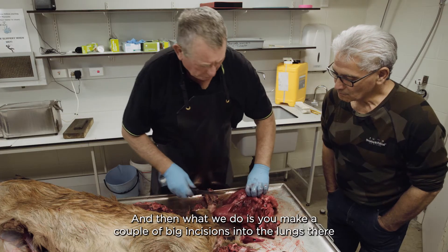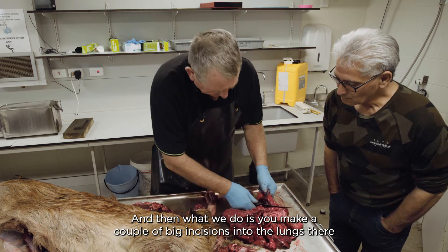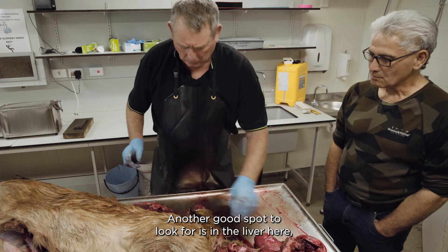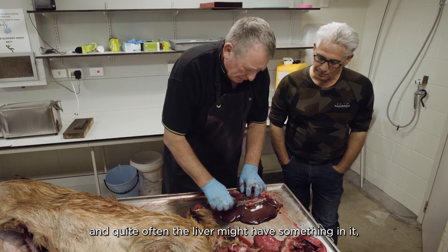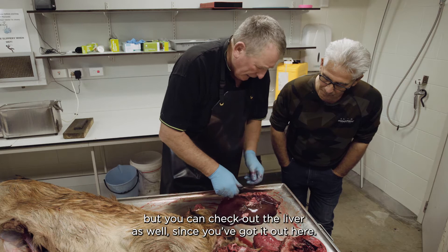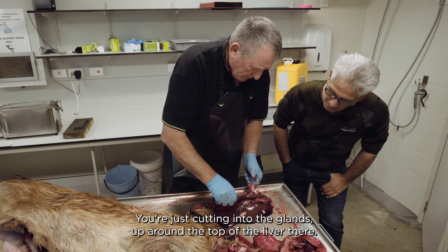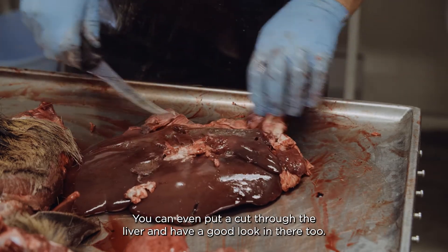We make a couple of big incisions into the lungs, just looking for any lumps or pus or anything like that. Another good spot to look is in the liver - quite often the liver might have something in it. Mainly the head and the lungs are the main spots, but you can check out the liver as well. Just cut into the glands up around the top of the liver, looking for pus. You can even put a cut through the liver and have a good look in there too.